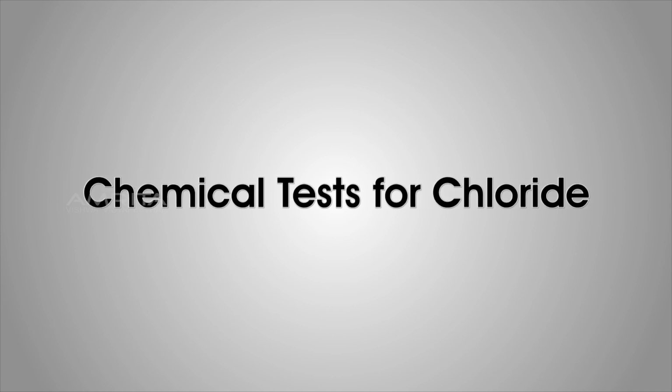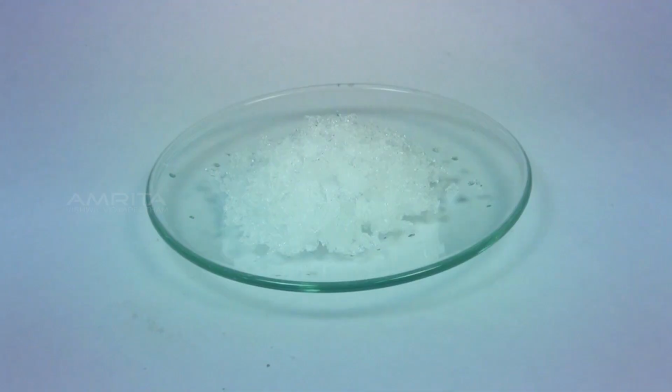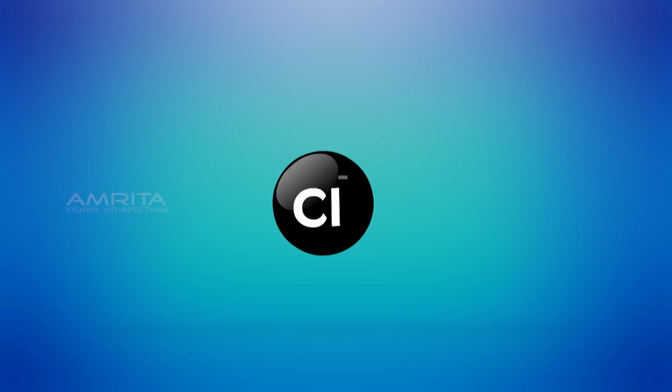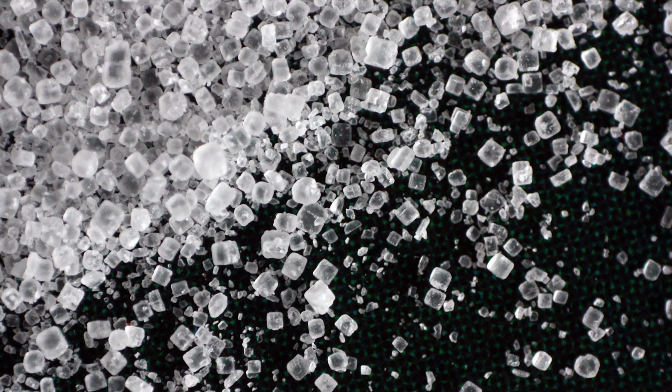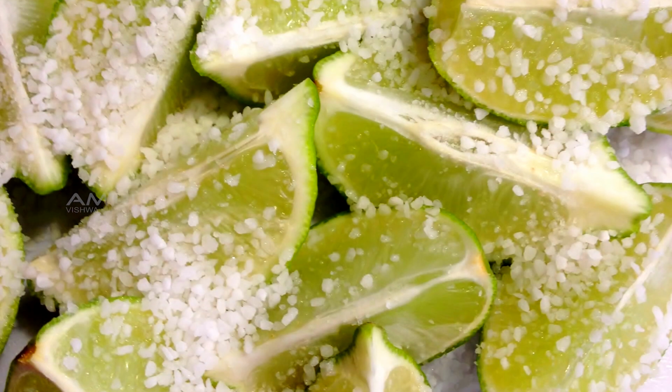Chemical tests for chloride. Chlorides are salts of chlorine gas containing the chloride ion. The chloride ion is formed when the element chlorine gains an electron. The most commonly known chloride salt is sodium chloride, which is used to preserve food.